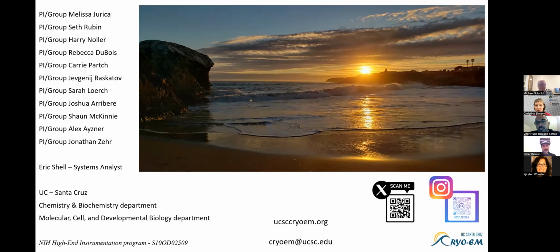Because you said you have more data now, is that giving you more particles, or more particles that are the same? I can't remember off the top of my head, but for the final reconstruction that we published, it's about 80,000. So it's not a huge number. And now we are close to 250,000.